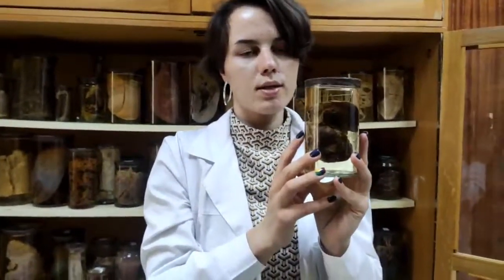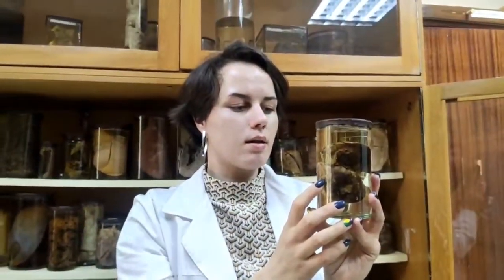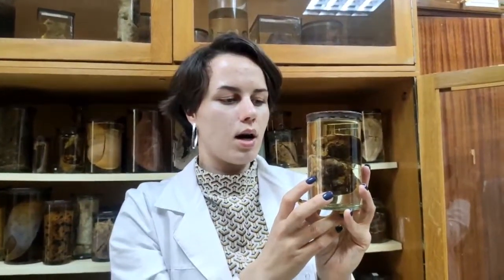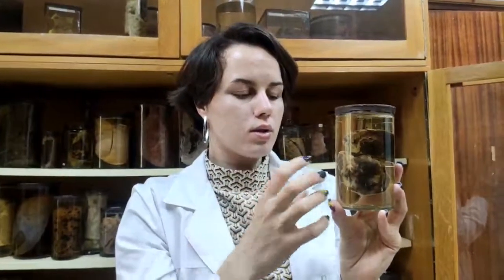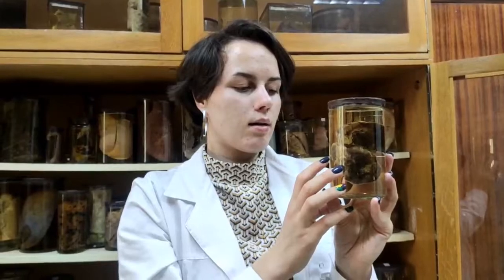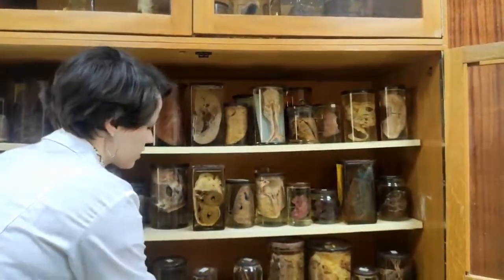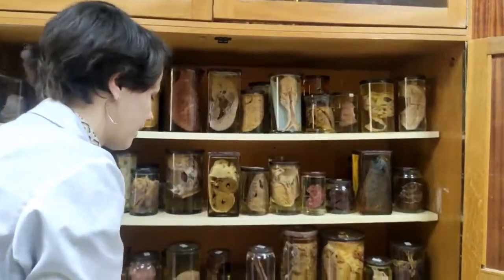Usually this complication is very severe because, as you can remember, the medulla secretes adrenaline and noradrenaline, which regulate our blood vessel tonus, and when we see such a lot of blood here, usually this function is lost. That is why these patients develop shock and die.